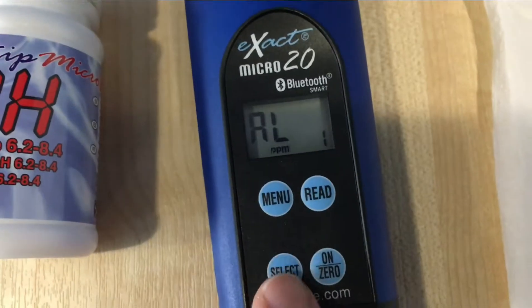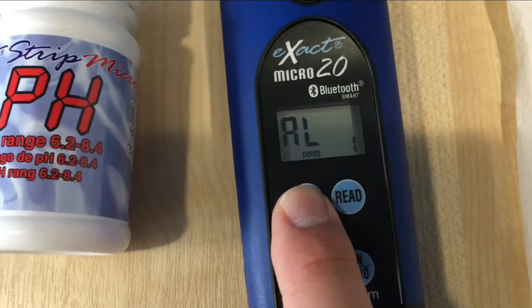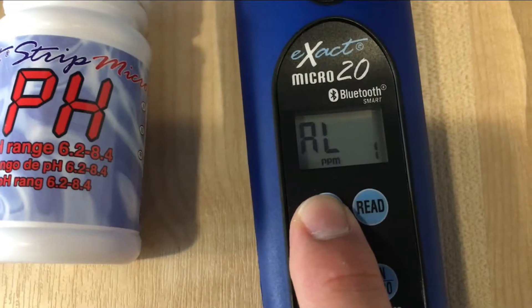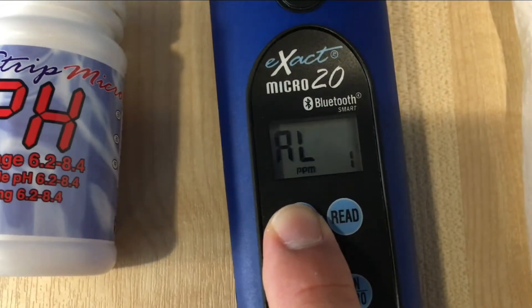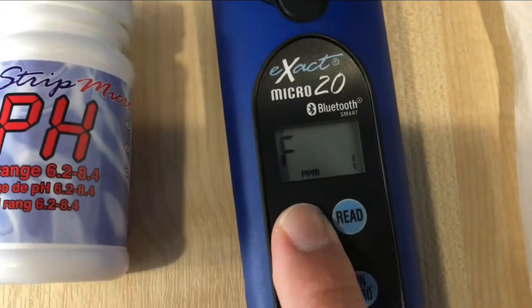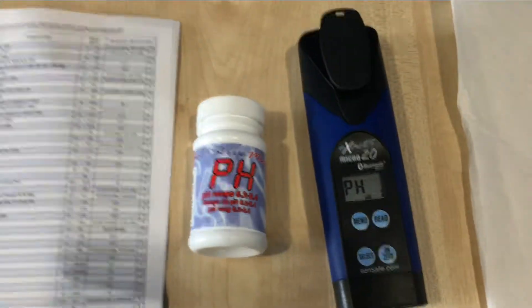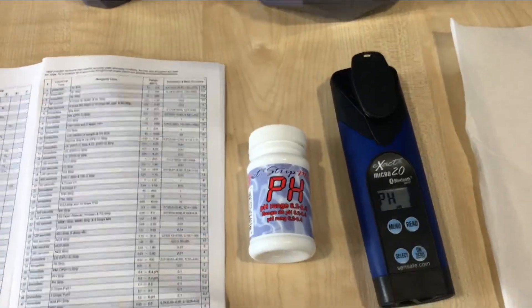Once you're happy with the select menu, you start with the menu to find pH. So pH 1 — AL is not it, CH, CL, F, PH. We found pH 1 just like it says in the manual.